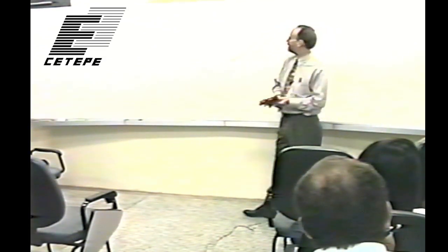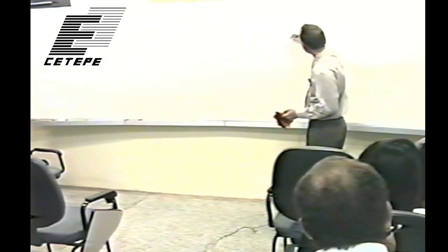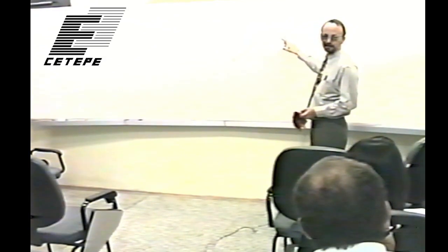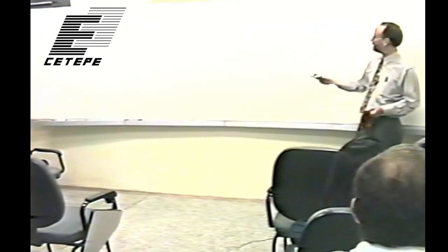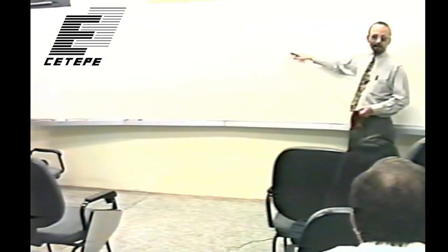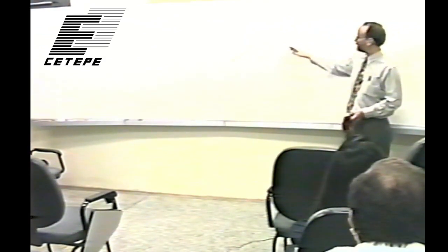So you might want to remember your anode Z number determines the location of these enhanced K lines in the spectrum, because of exactly the same phenomenon. You're having an increased likelihood of electrons undergoing that characteristic interaction where they knock out an inner shell electron and you get this characteristic radiation. This is a function of Z number.